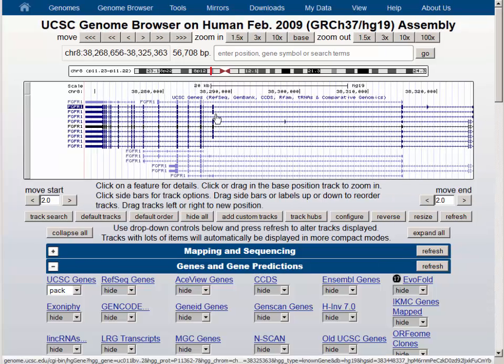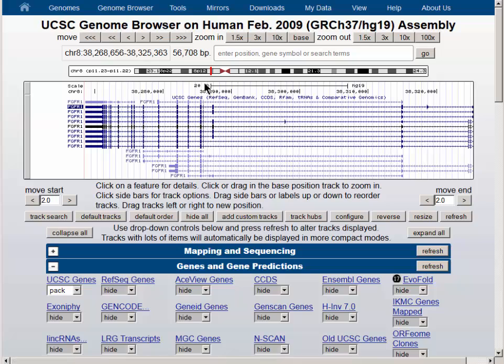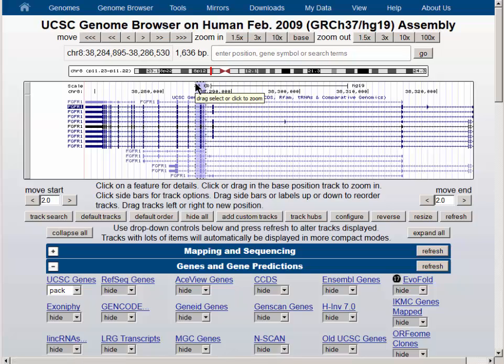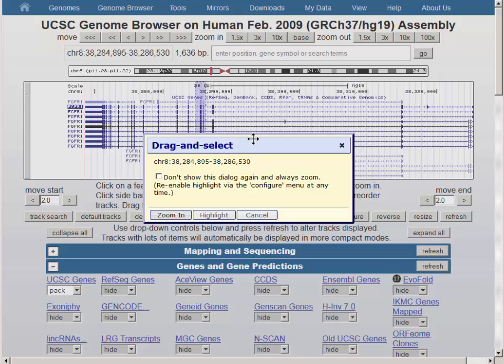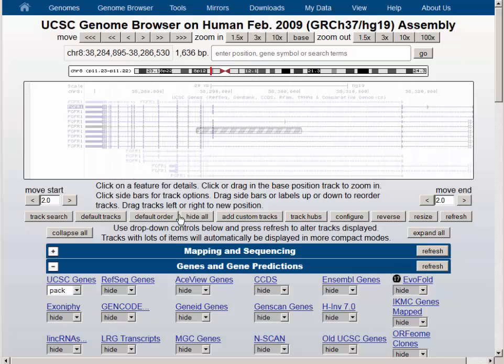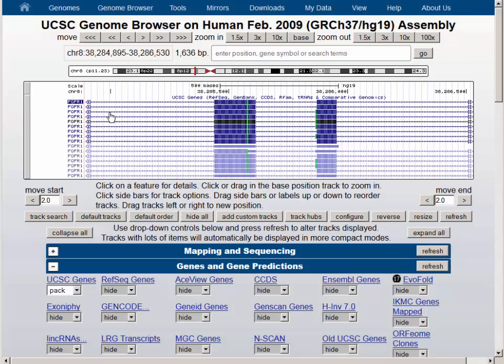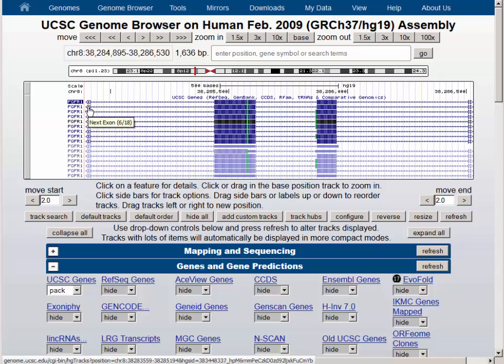In the center of the screen you can see several large exons that are in some isoforms and not others. Let's zoom in to the region just downstream from that exon, which is to the left because this gene is transcribed from right to left. The zoom in button then takes us into these exons we have just selected, and we can use the mouse over to see that the next exon off screen will be number 7 out of 19 on this isoform, number 6 out of 18 on this isoform, and number 5 out of 17 on this isoform.